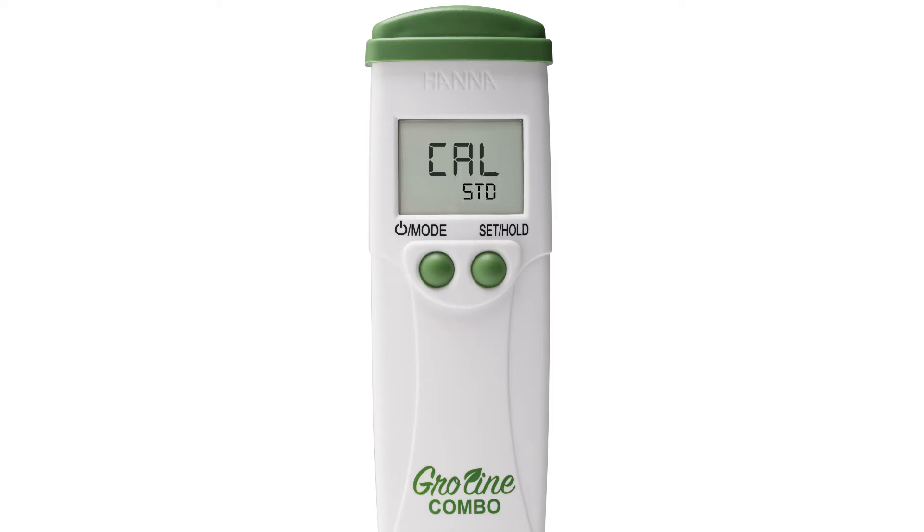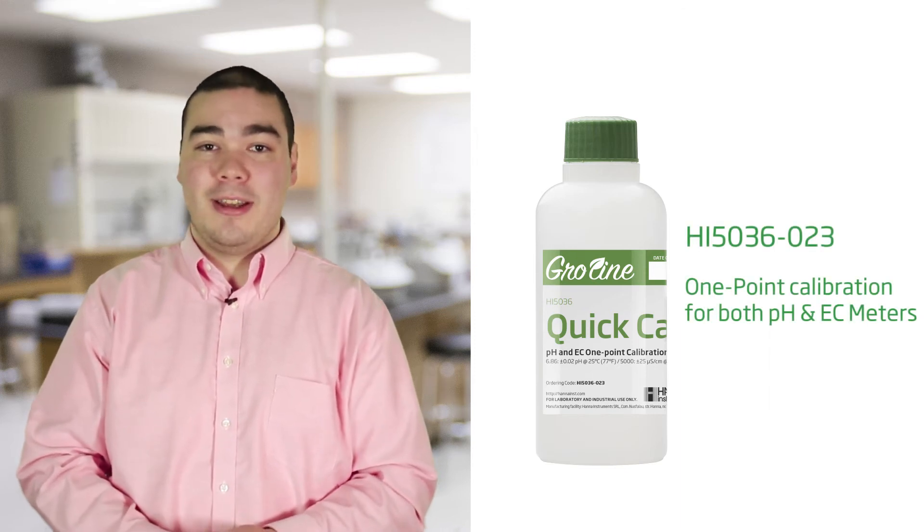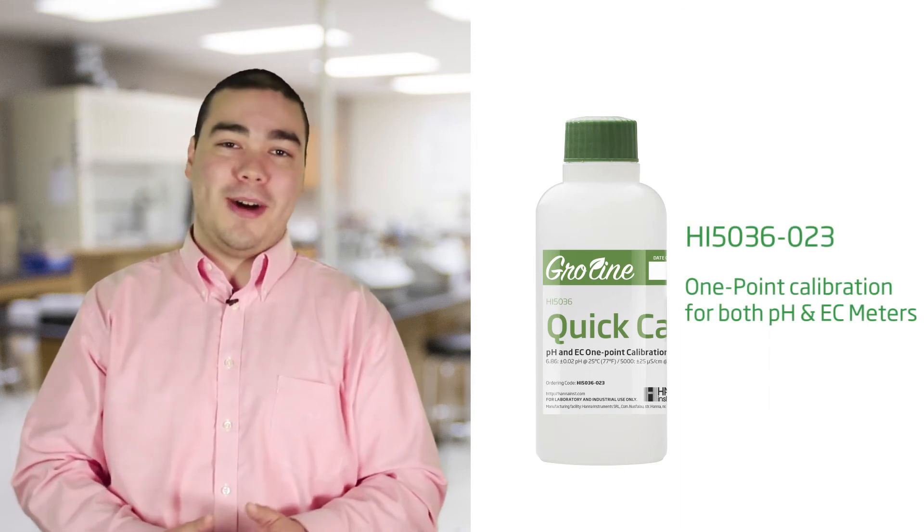By pressing the set hold button you can choose between Cal Standard and Cal Quick. Cal Quick allows you to use our GroLine quick calibration solution. This solution is for a one-point calibration in both pH and EC — it's like having two solutions in one bottle.